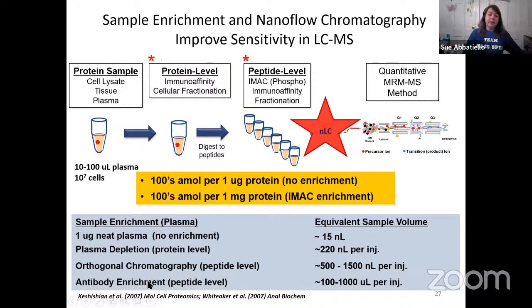And then antibody enrichment, like anti-peptide antibodies, allow us to just pull out those peptides and ones super similar to them, which is like a tiny little subset of the whole sample. And this can translate to starting with a volume of a milliliter of plasma, and then taking all of that and injecting onto the column.